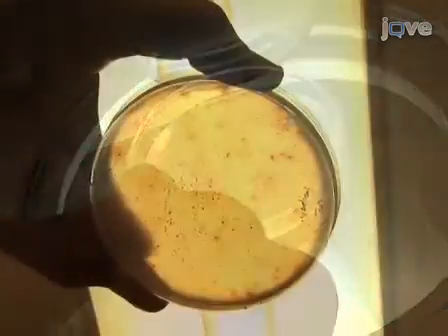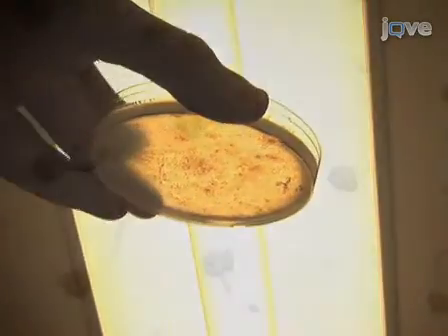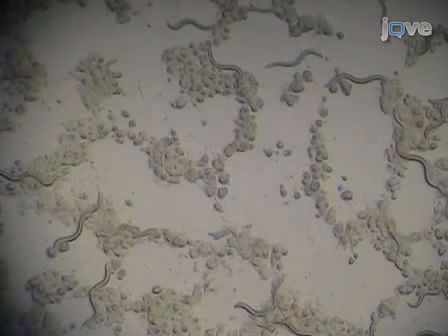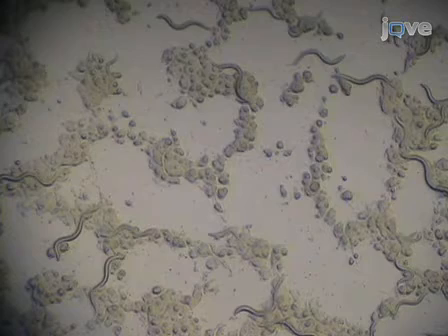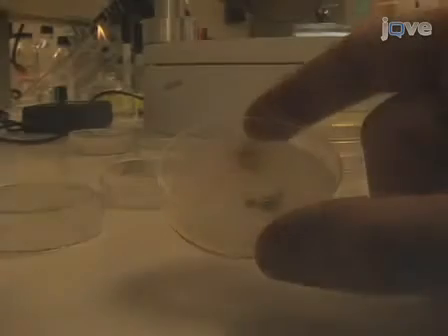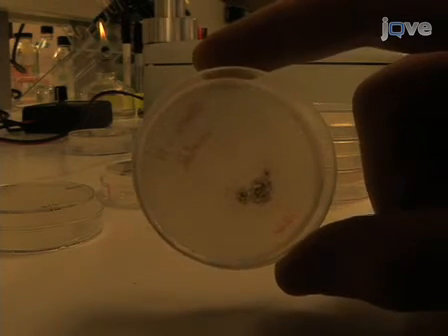Worms should also be transferred to fresh plates if living, growing bacteria are observed. Generally, the combination of AMP and UV killing will ensure that no live bacteria contaminate the experiment, but occasionally it occurs. Also transfer the worms if fungal growth is observed on the media. If caught early enough, fungus can be cut out using a pipette tip or spatula. Once it grows to be larger than a few millimeters in diameter, it is usually easier to transfer the worms to a new plate.